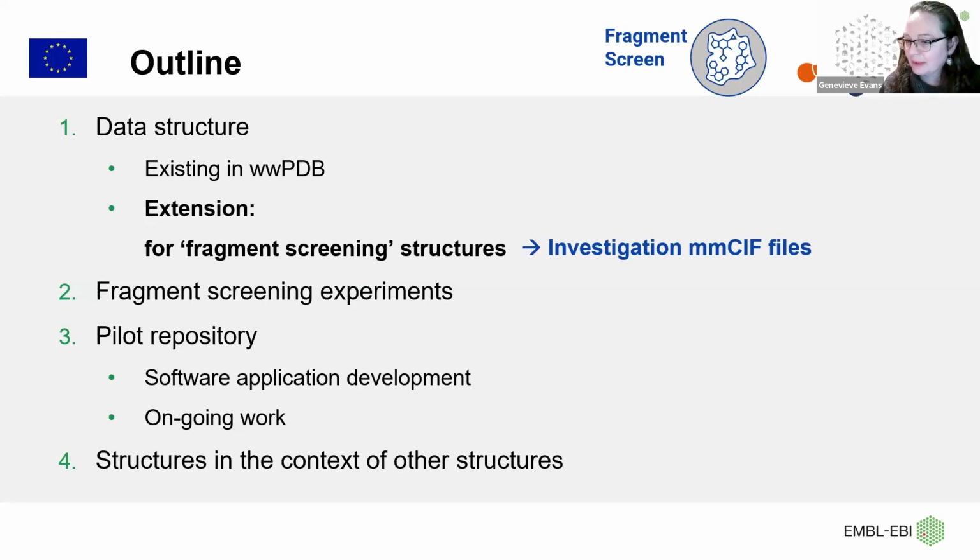Some of the broader implications of capturing this metadata for fragment screening also relate to capturing metadata for sets of structures from other methods. For example, in time-resolved crystallography data sets, there are often multiple structures determined, and there's potentially a defined relationship between these structures that could benefit from an investigation mmCIF file.